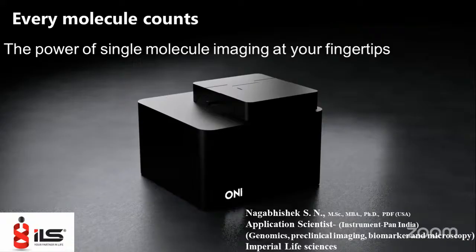The difficulties you're facing would be resolved using super resolution microscopy, and that's what we are demonstrating today.